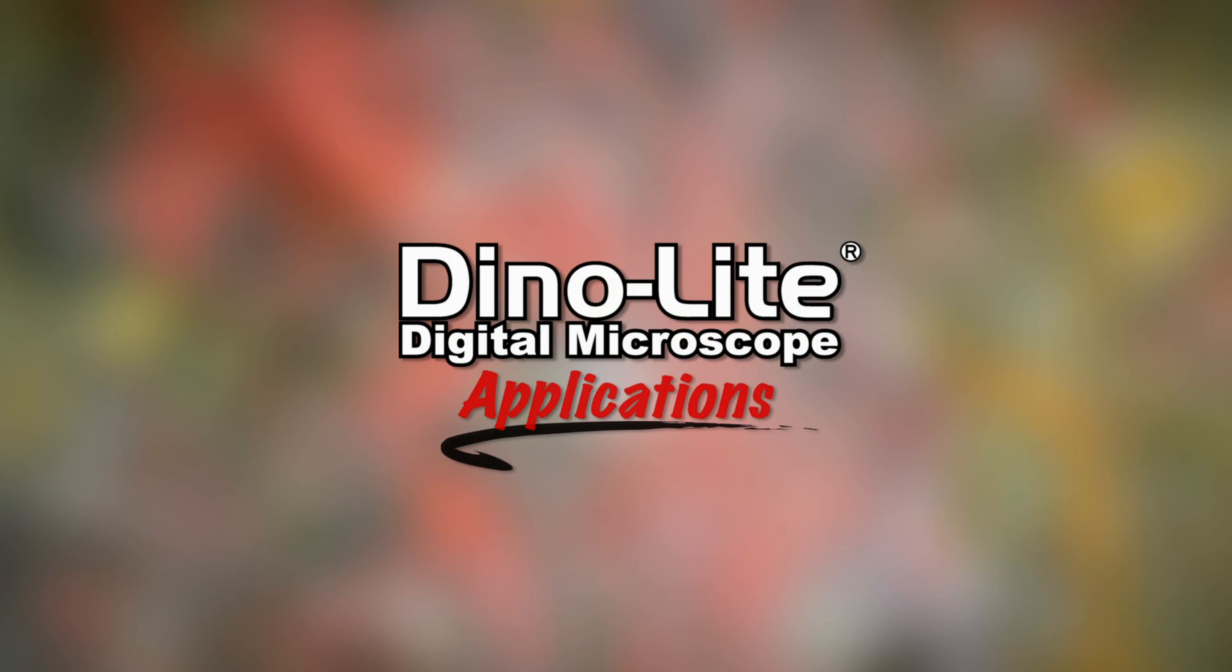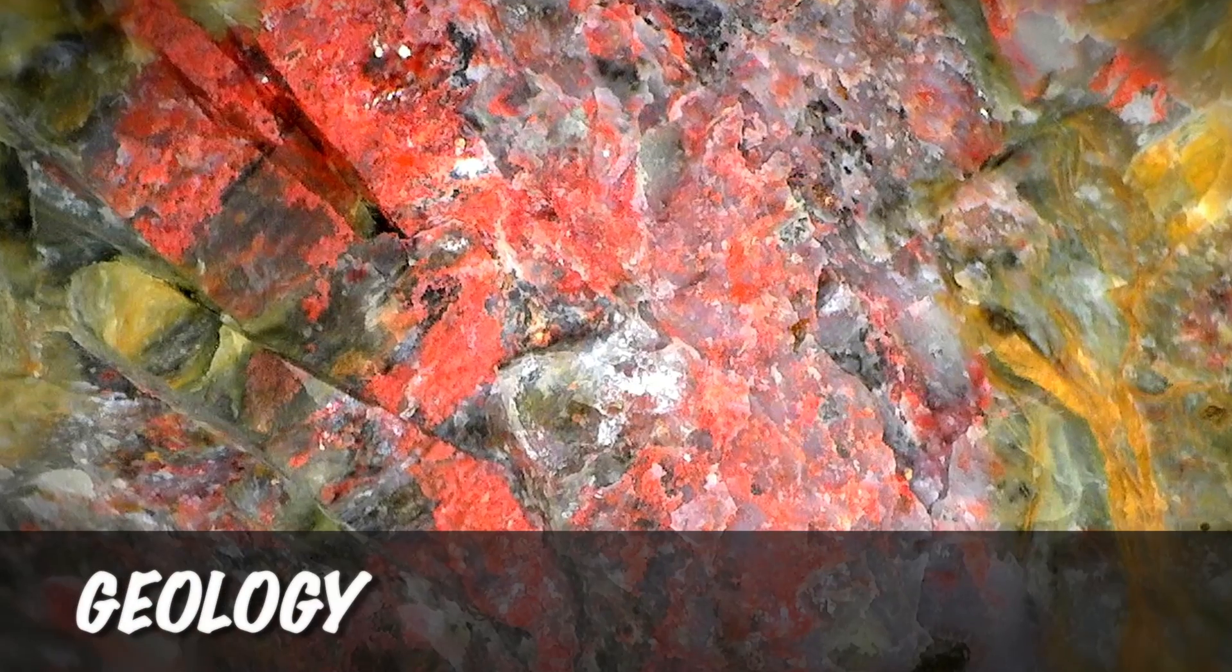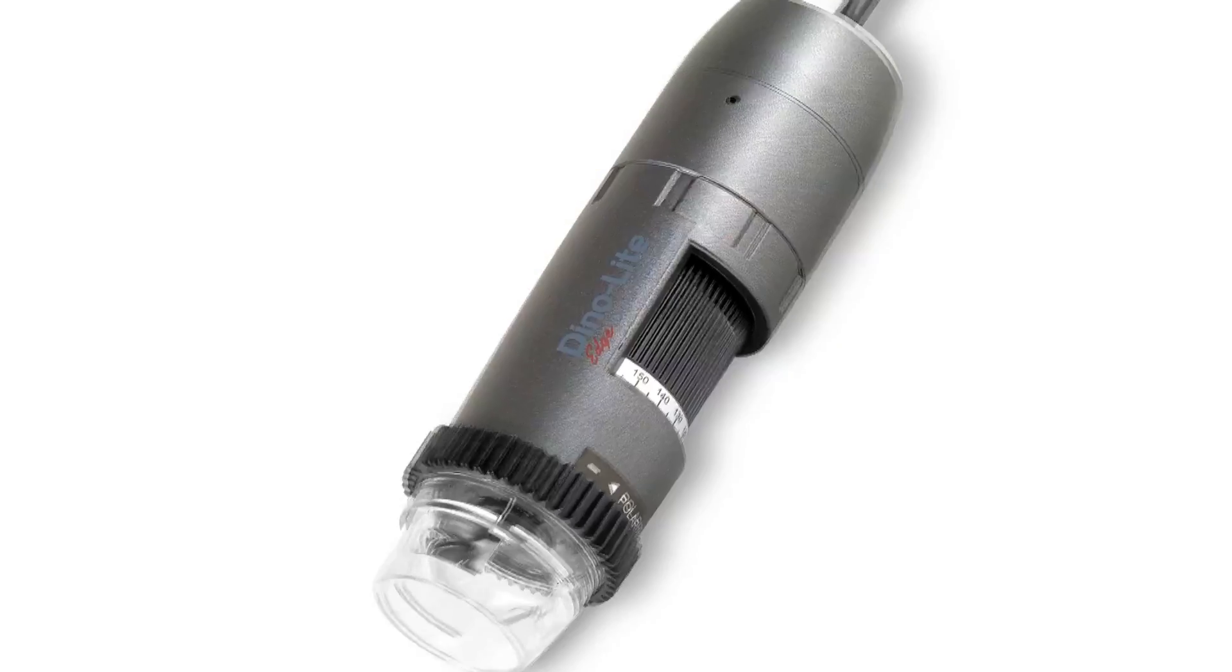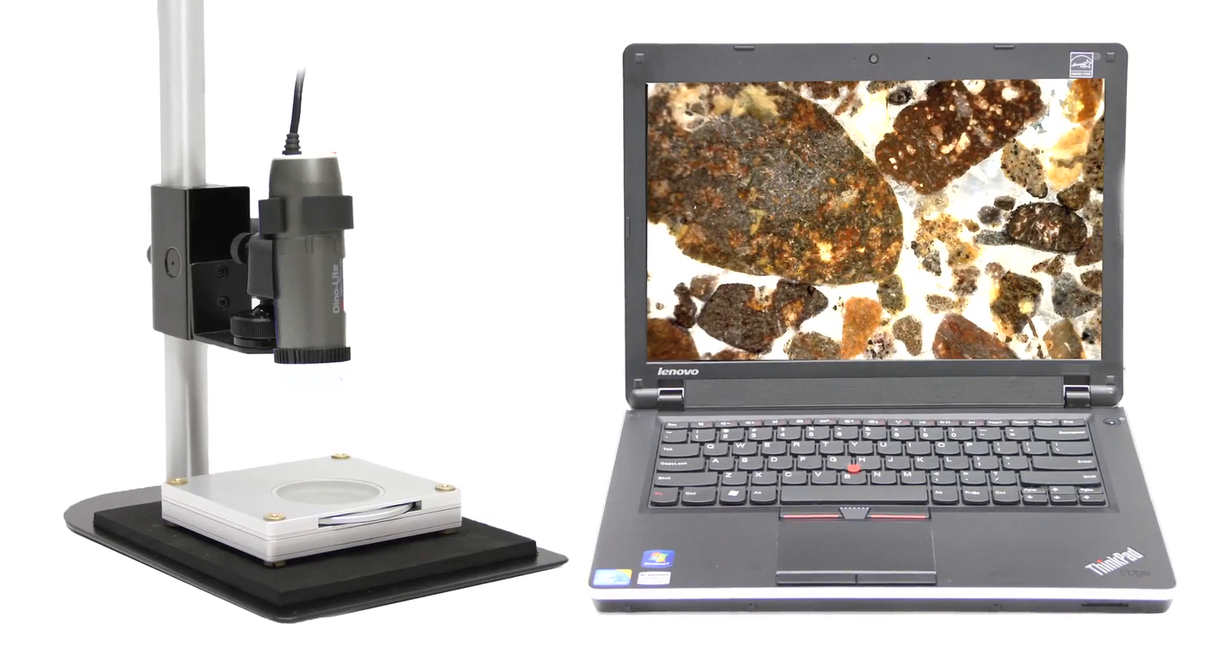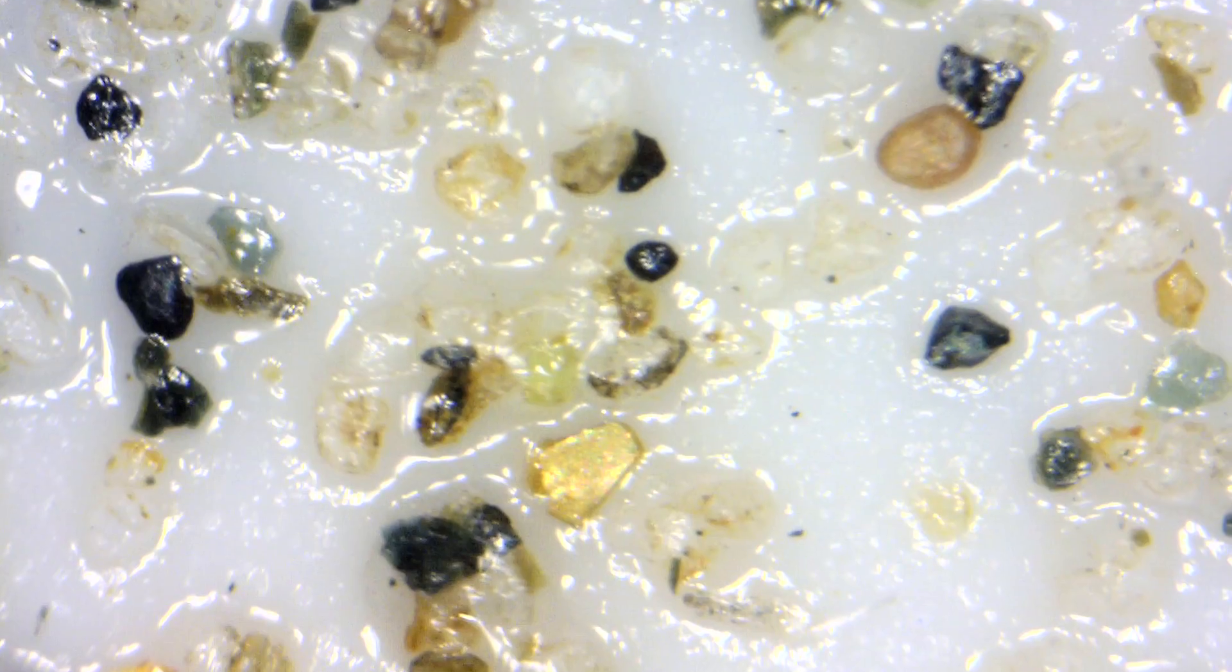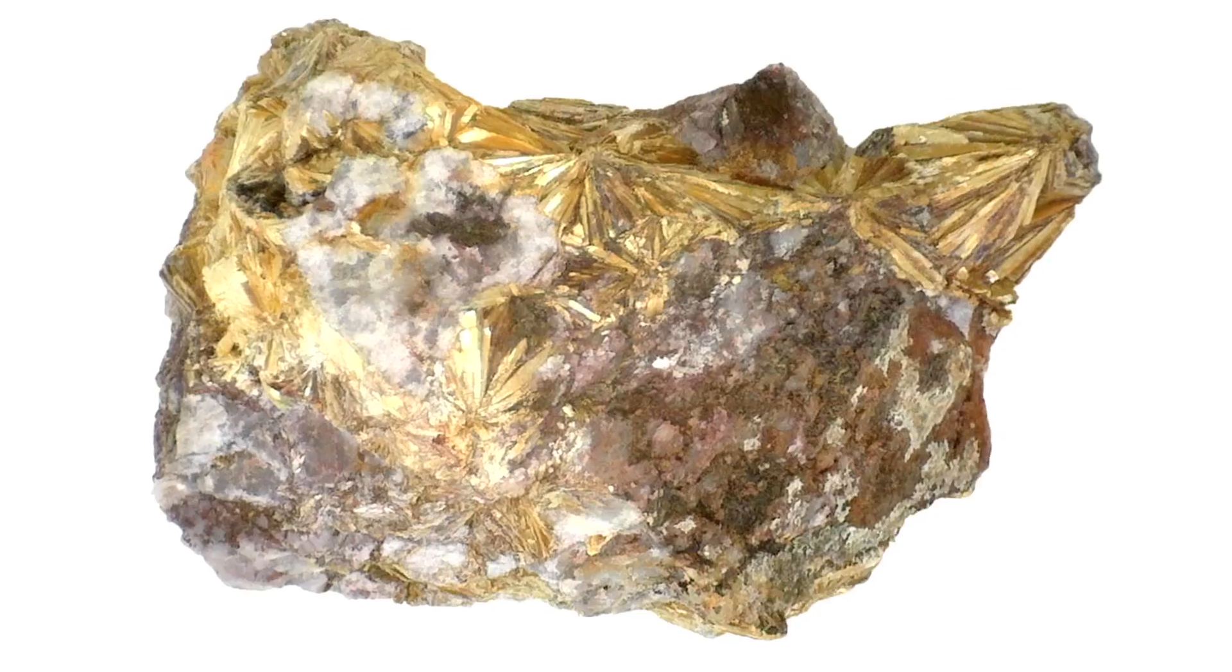This is a Dynolite Digital Microscope application video focusing on geology. All of the sample images shown were captured by Dynolite microscopes and in this video we'll talk about the best models and ways to capture images like these.